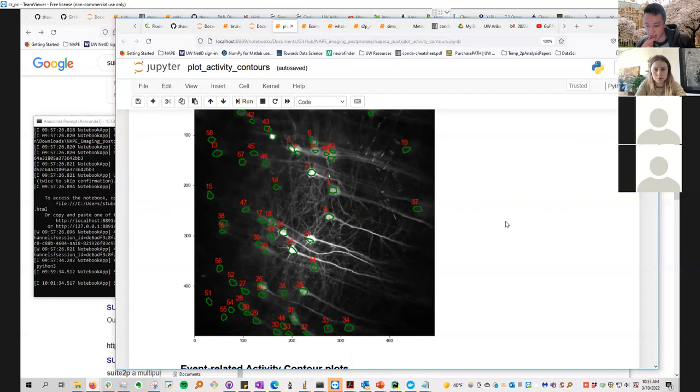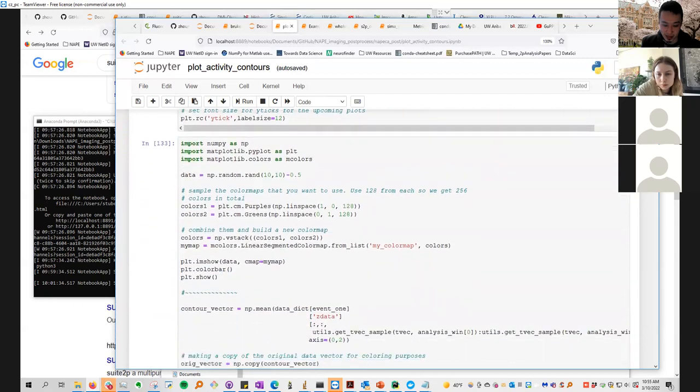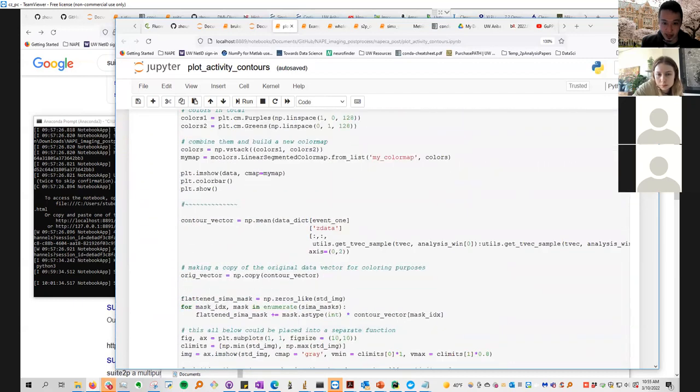What do you mean by load individual cells? So right now the code loads individual photometry experiments by the entire group. And so I just need to adapt that so that it's pulling in individual cell files, individual ROIs. Yeah, I think that should be pretty straightforward. And you can look through this code to see how I do that if you want. Yeah, I don't think it'll be hard at all. Okay, so I'll work on all that file transformation stuff for both Inscopix and Suite2P.